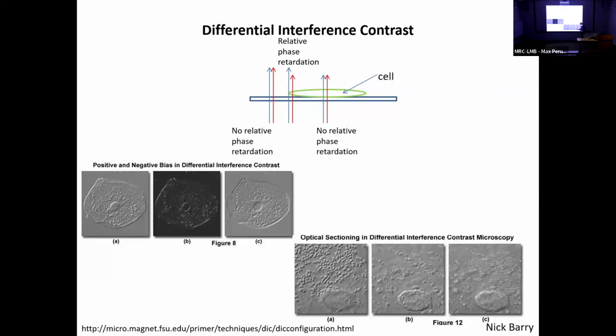But what is remarkable is the amount of detail that interferometer can give you. So here's a small variation in depth in focal plane, and you can see there's lots and lots of contrast that this sort of microscopy can generate.